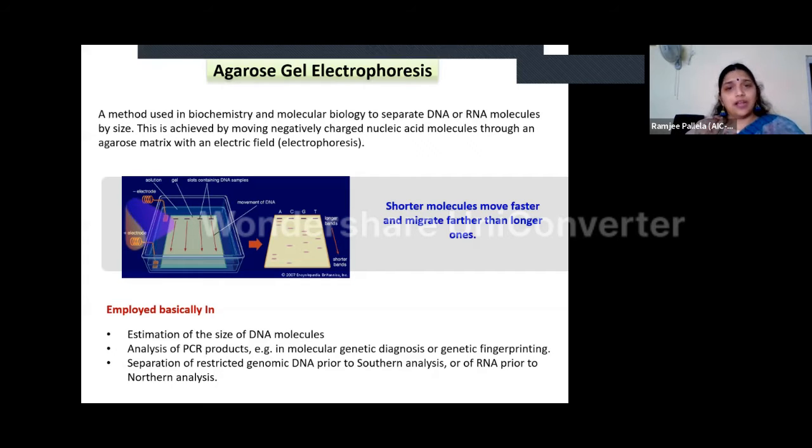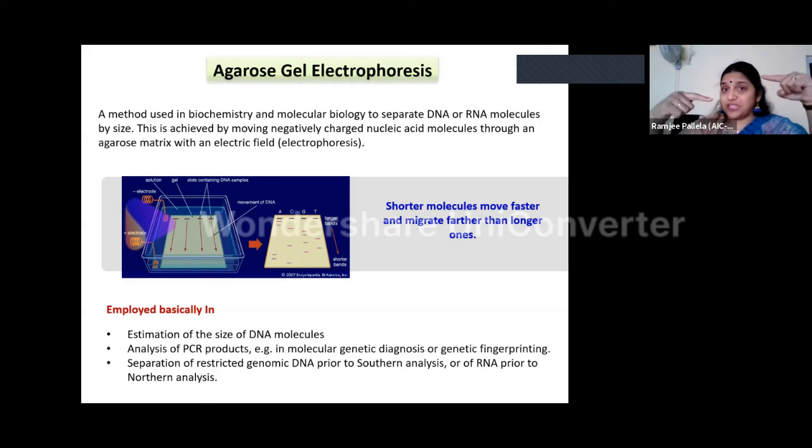So like that, we can check that my amplicon is coming somewhere near the 300 size band. So my amplicon must be around 300 size. You can cross check it with your primer sequence. You remember initially you designed a primer for this particular gene segment. When you put your primer sequence here, you can count how many base pairs are there in between these primer sequences. So that many base pairs should be in the amplicon, right? So this is a cross check.